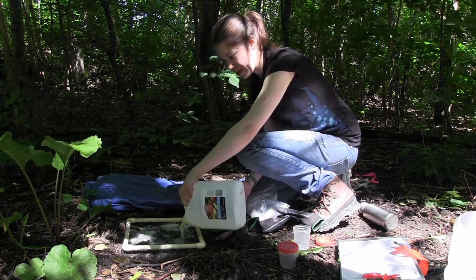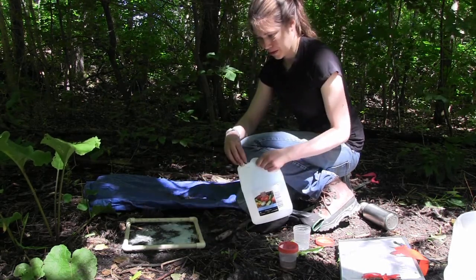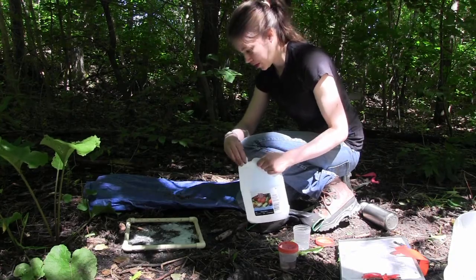You want to try to find a relatively flat area to sample if you're using mustard, because otherwise it will flow out of the plot entirely.